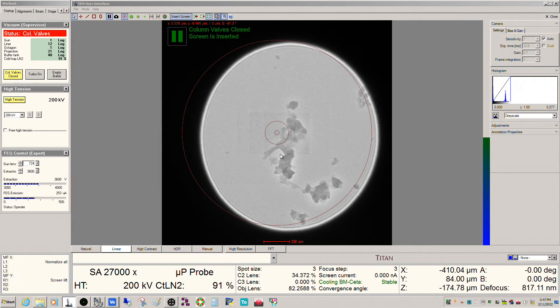All right, so I got another Themis video today. I wanted to do a shorter one talking about dealing with the gun and your day-to-day operation of the tool. So first thing to understand about this particular Themis is that it has a fairly specialized gun configuration — it has an X-FEG as well as a monochromator.